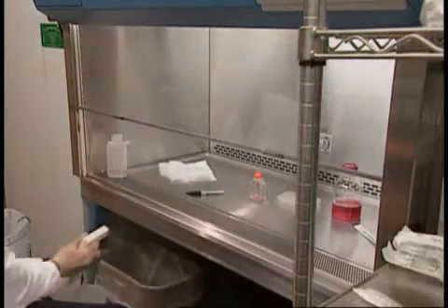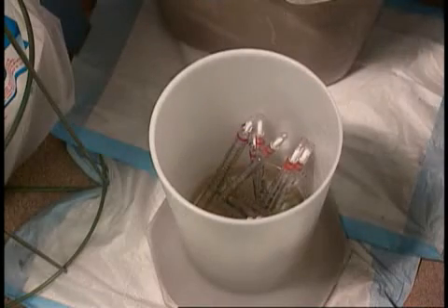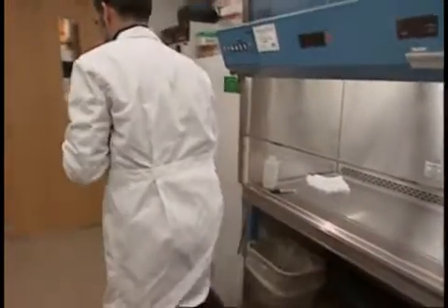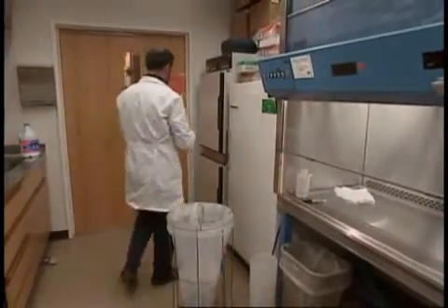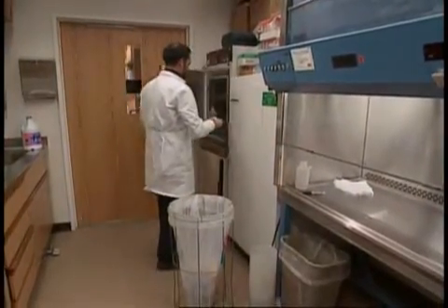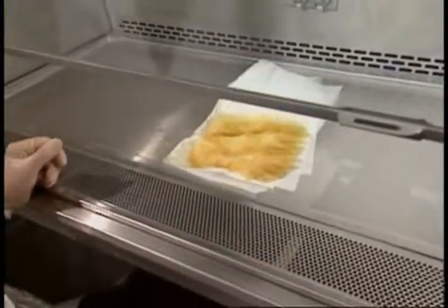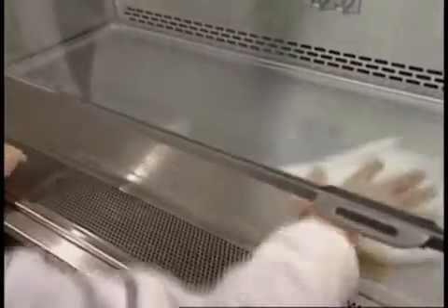Pipettes go into a bleach solution before being discarded as biohazard waste. After each use, Mohammed decontaminates the work surface with alcohol. Any spills or splashes are cleaned up right away.